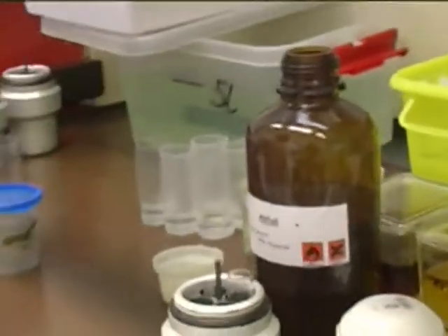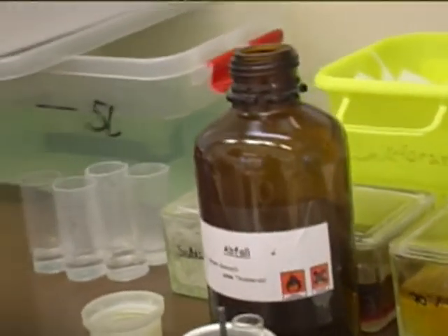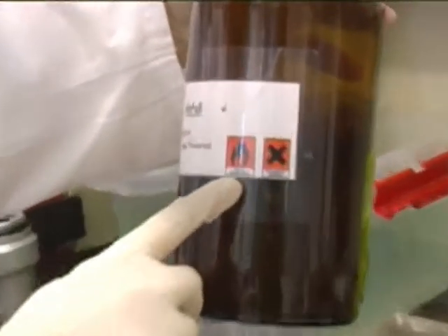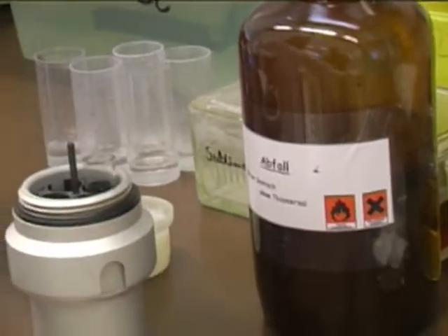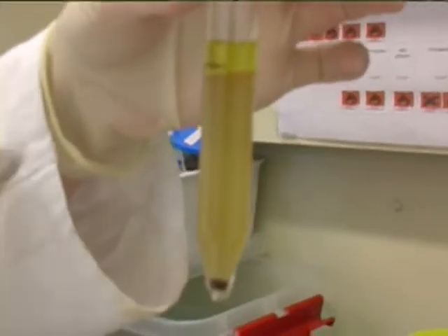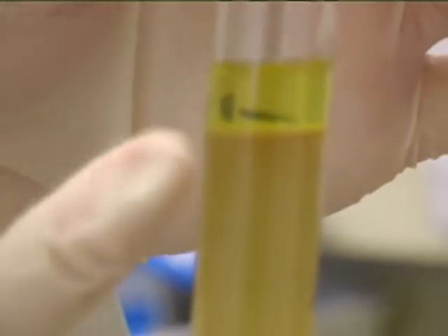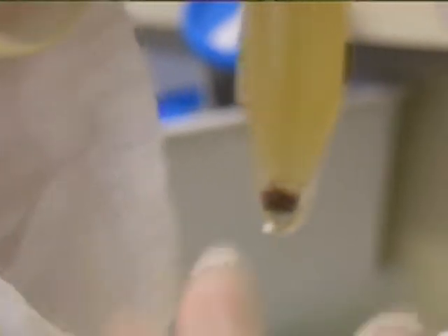So we have a specific waste for ether, because it's very dangerous. It's inflammable and not good for your health. Okay, now this is the ether. You don't need this. What you need is the sediment down there.